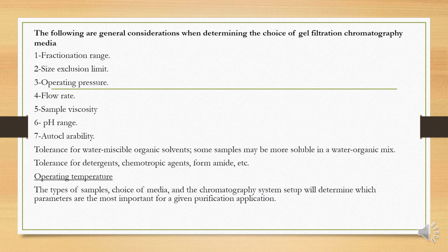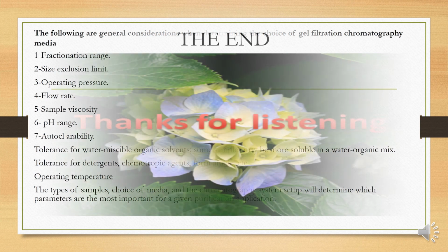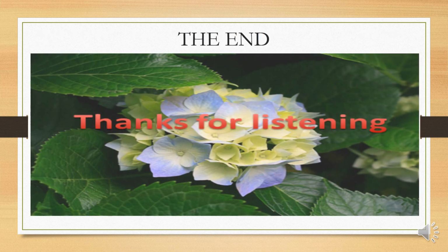And finally, media operation temperature. The type of sample, choice of media, and chromatography system will determine which parameters are the most important for a given purification application. The end. Thank you for listening.